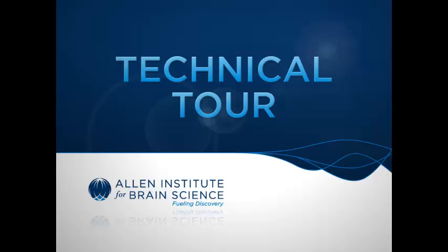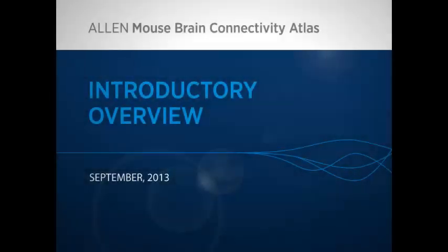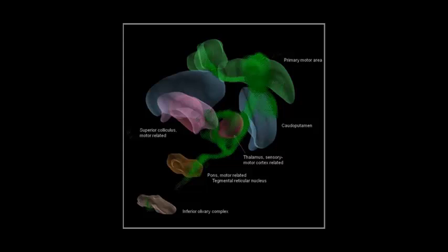Welcome to the Allen Institute for Brain Science technical tour. This video demonstrates the navigation and data mining features of our newest dataset. The Allen Mouse Brain Connectivity Atlas is a high-resolution map of neuronal connections in the mouse brain.